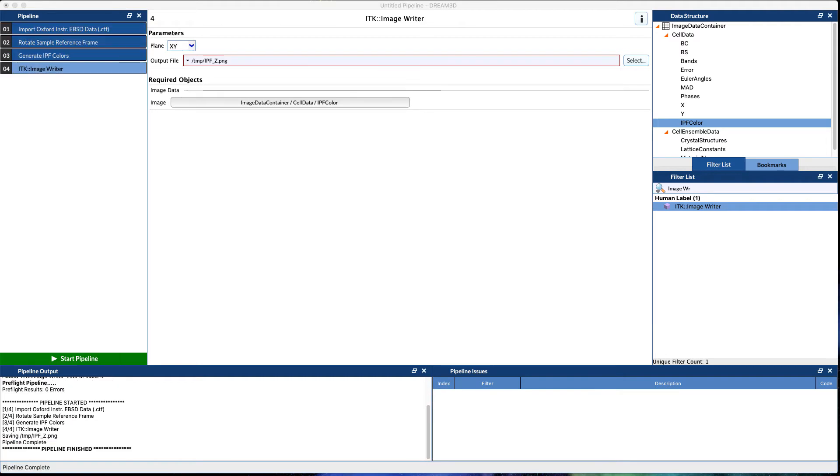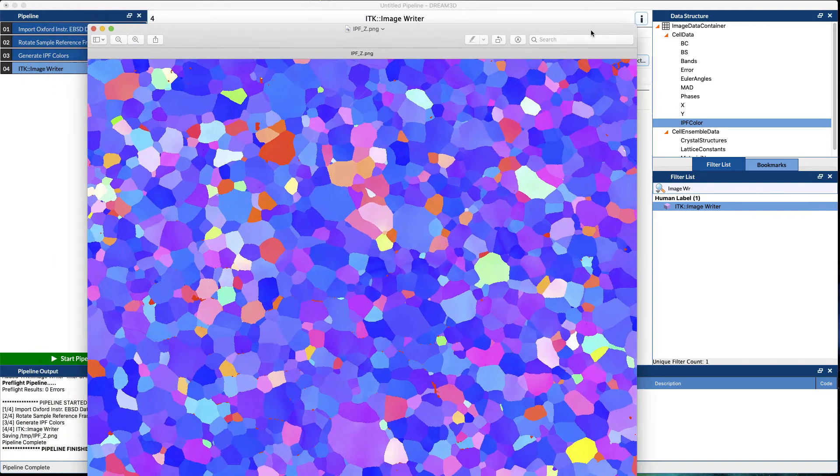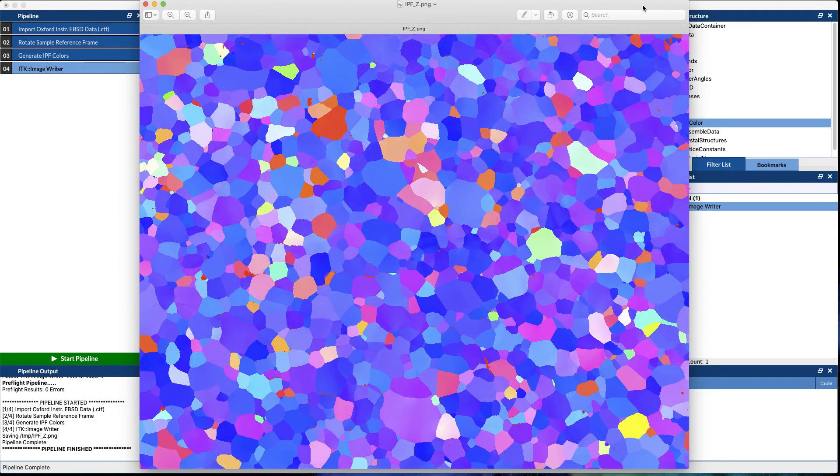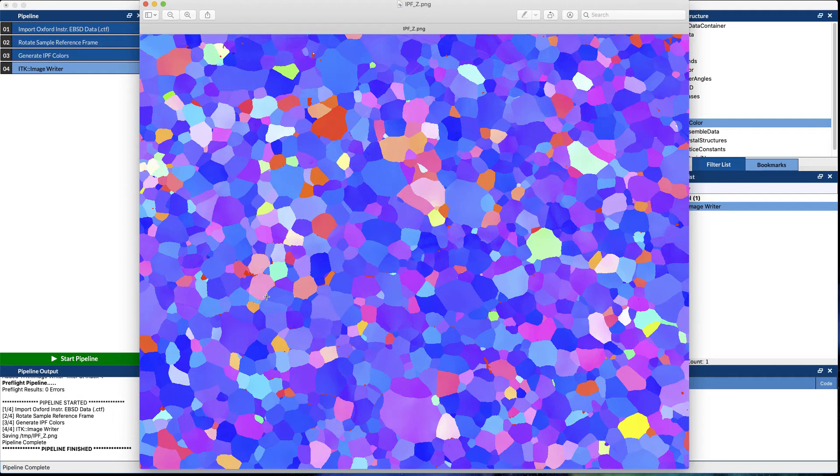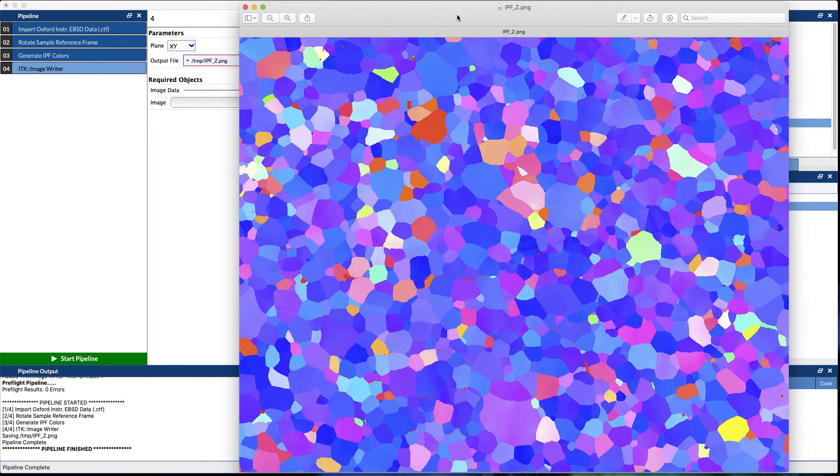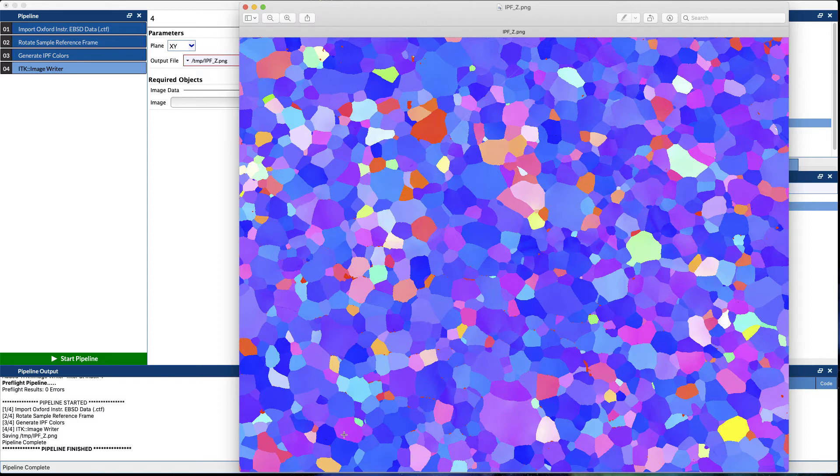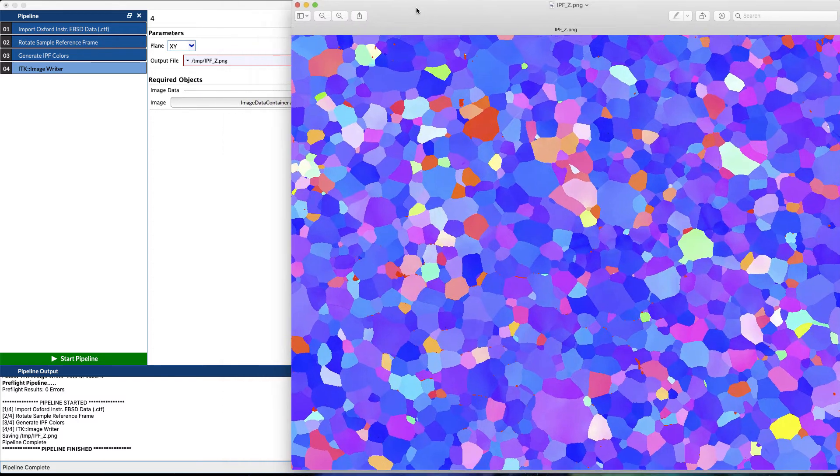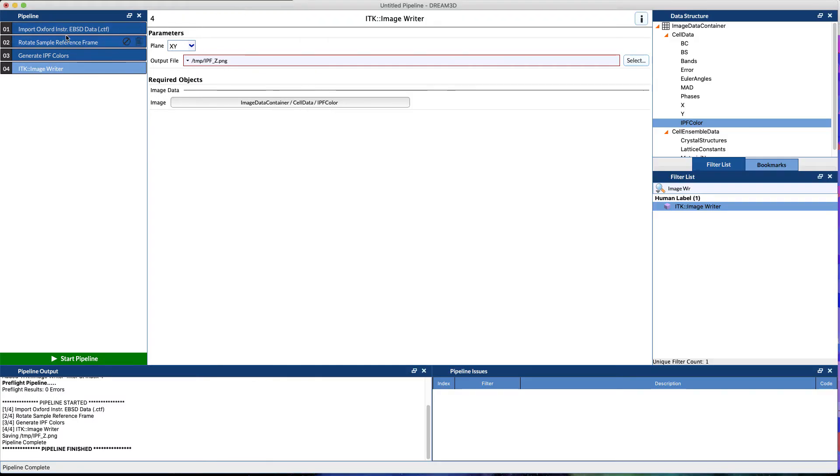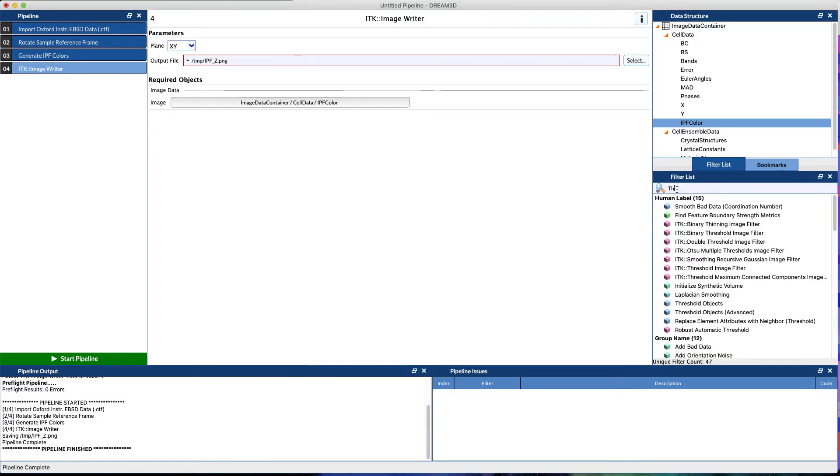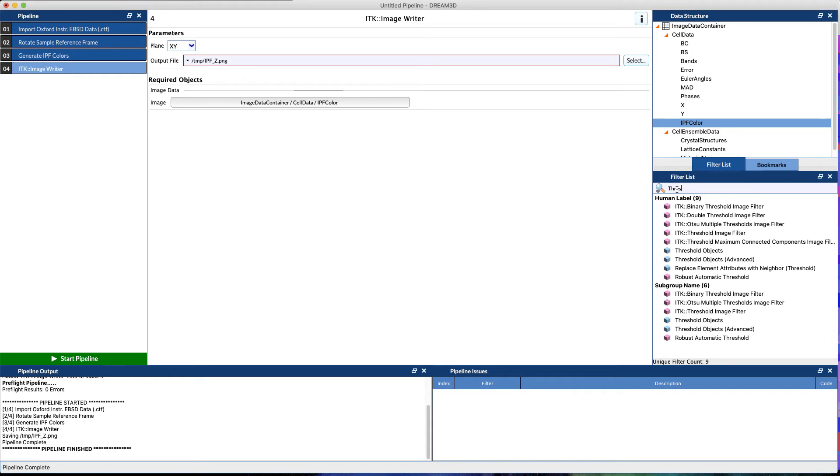While that's running, we'll get our image together, and this is what the output IPF image looks like. This one's a pretty clean EBSD map, but there are some issues in there. If you didn't get good indexing, what you want to do is start filtering those out to see exactly maybe what didn't get indexed. So let's add in a threshold filter quickly.